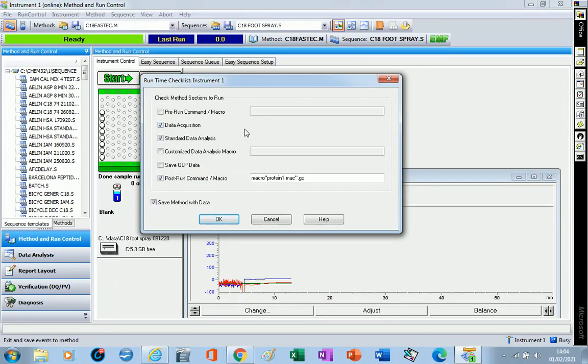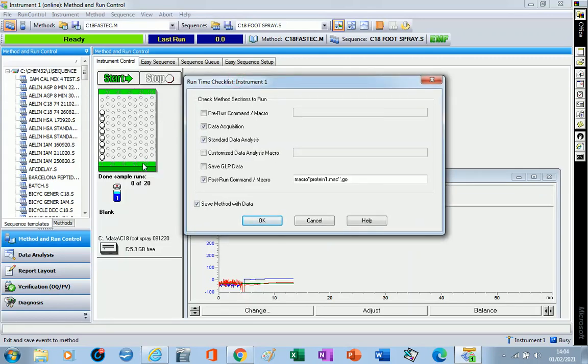And standard data acquisition, here I have a macro. Sometimes I use this instrument to measure lipophilicity of the compounds, which converts the major peak retention time to a lipophilicity value. And you can see that in my system I can inject 99 compounds in one run, and I don't want to look up each of the 99 chromatograms and write down manually the biggest peak retention time.